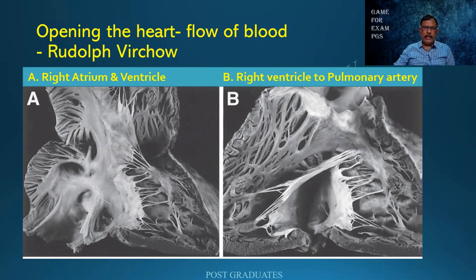I'll have to look into the pulmonary artery and the tricuspid valve, and finally I will have to open it up. And when I do open, I'll be finding the pulmonary artery over here. So I look for any of the abnormalities. It can be acquired, it can be congenital. So the right side of the heart is open.